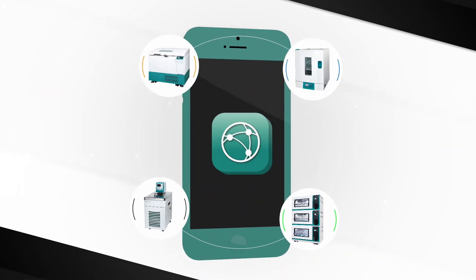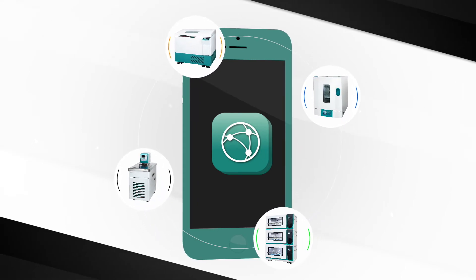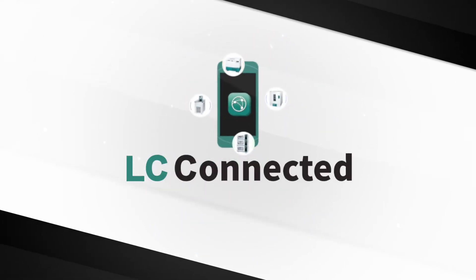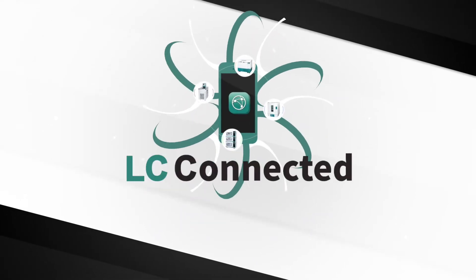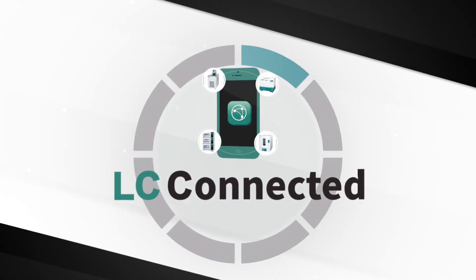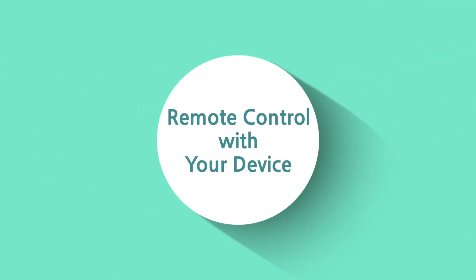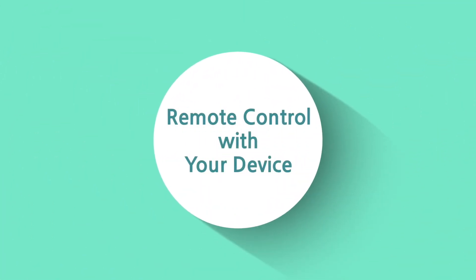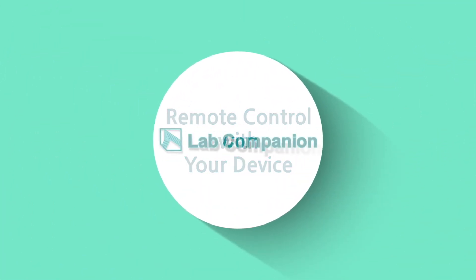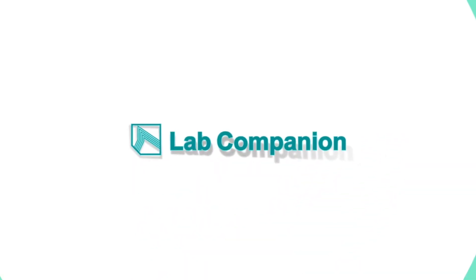Take advantage of the innovations brought by LC connected and immediately discover a new way to fully control the entire laboratory at the press of a button. Upgrade now, lab companion.